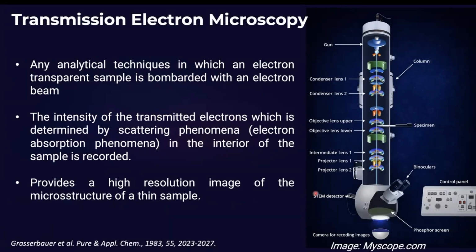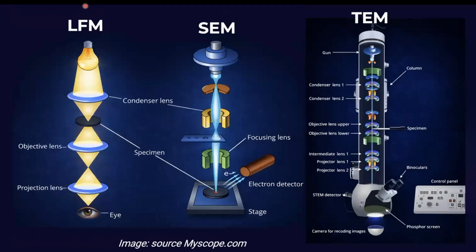It provides a very high resolution image of micro or nanostructures, nowadays atomic. If you look at the complexity, how it changes as we move on, the complexity and also the cost and the maintenance of this instrument increases. Since I've been working on TEM over the last 15 years, I will focus a bit more on it.